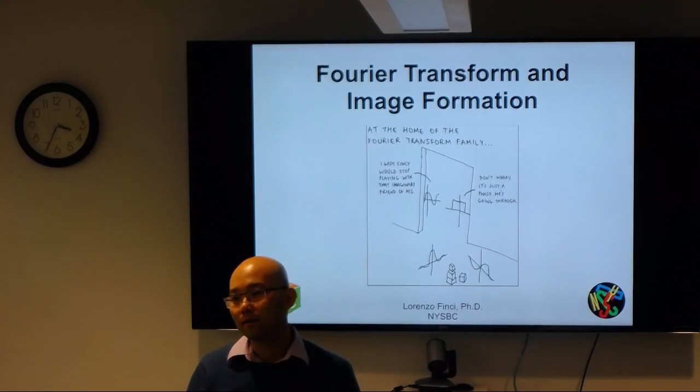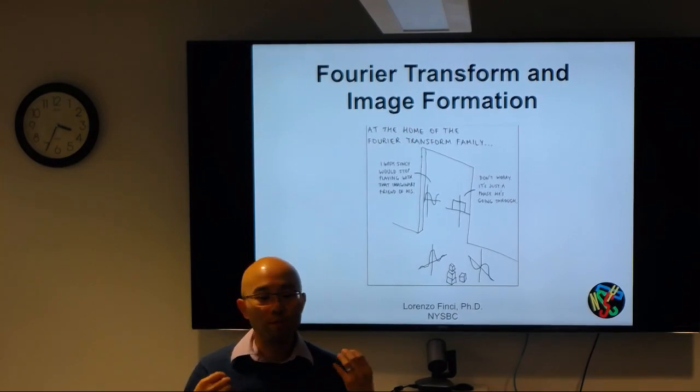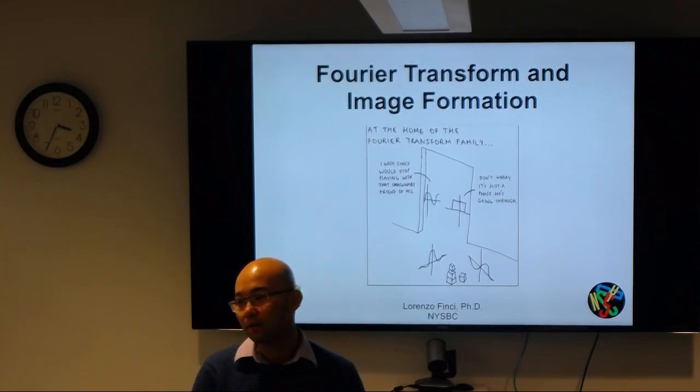A lot of what we do is in Fourier space, and a lot of that is math that we might not actively have to think about, but it helps inform our experiments and helps make the whole technique a little bit easier and more practical to use.